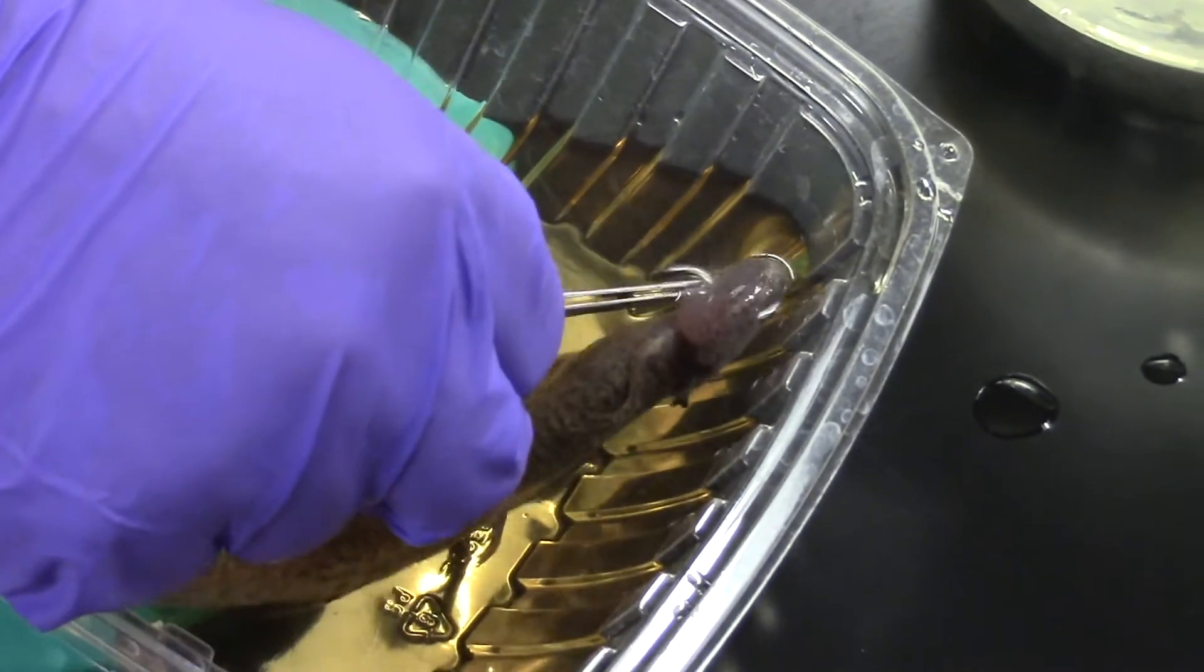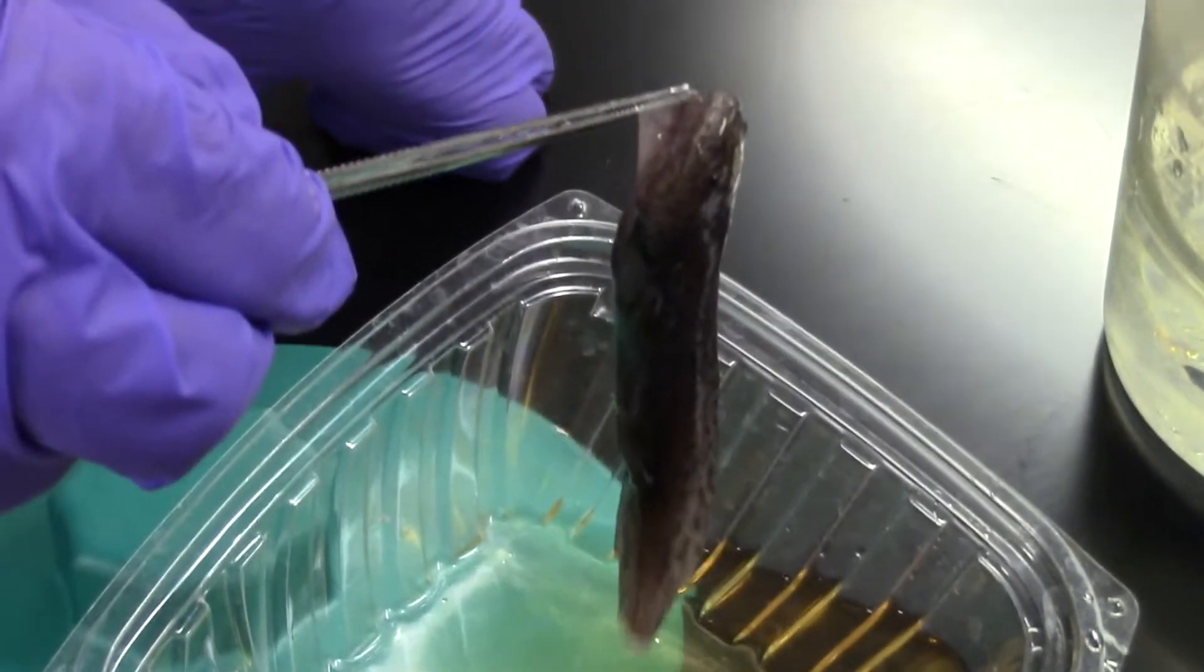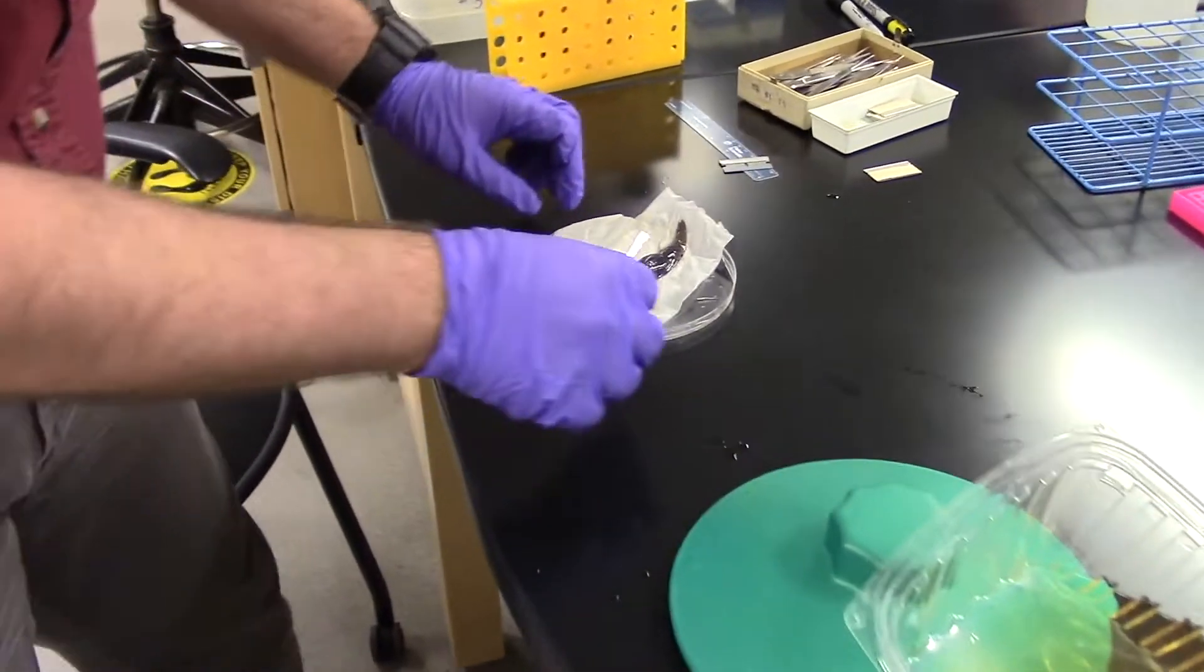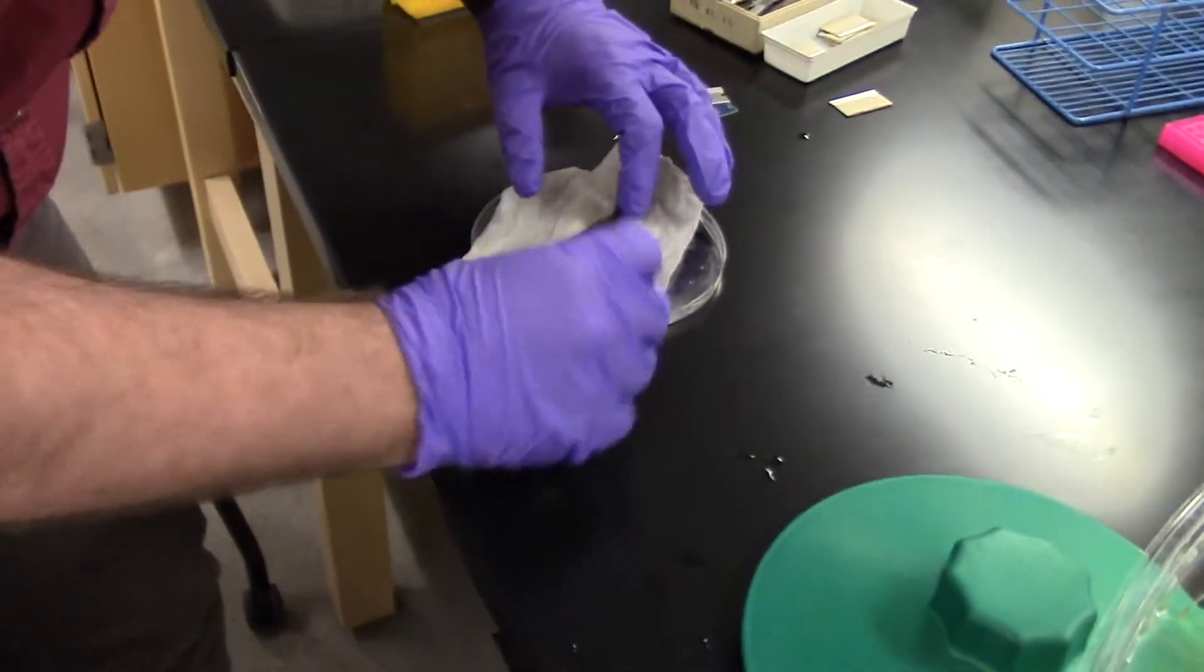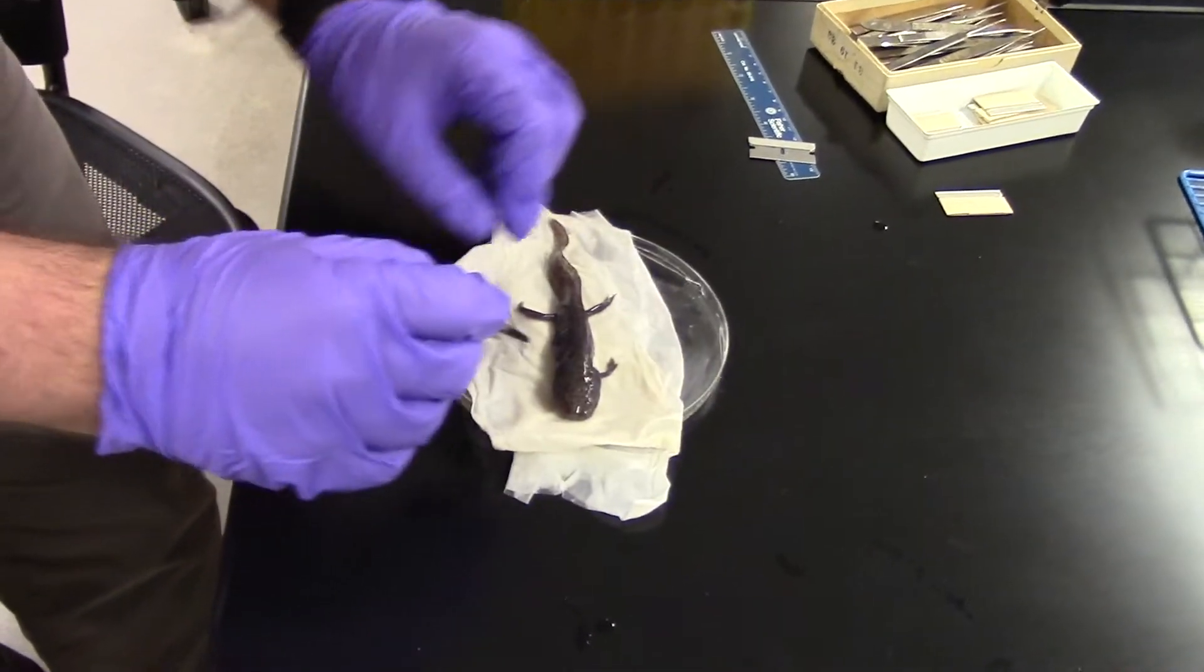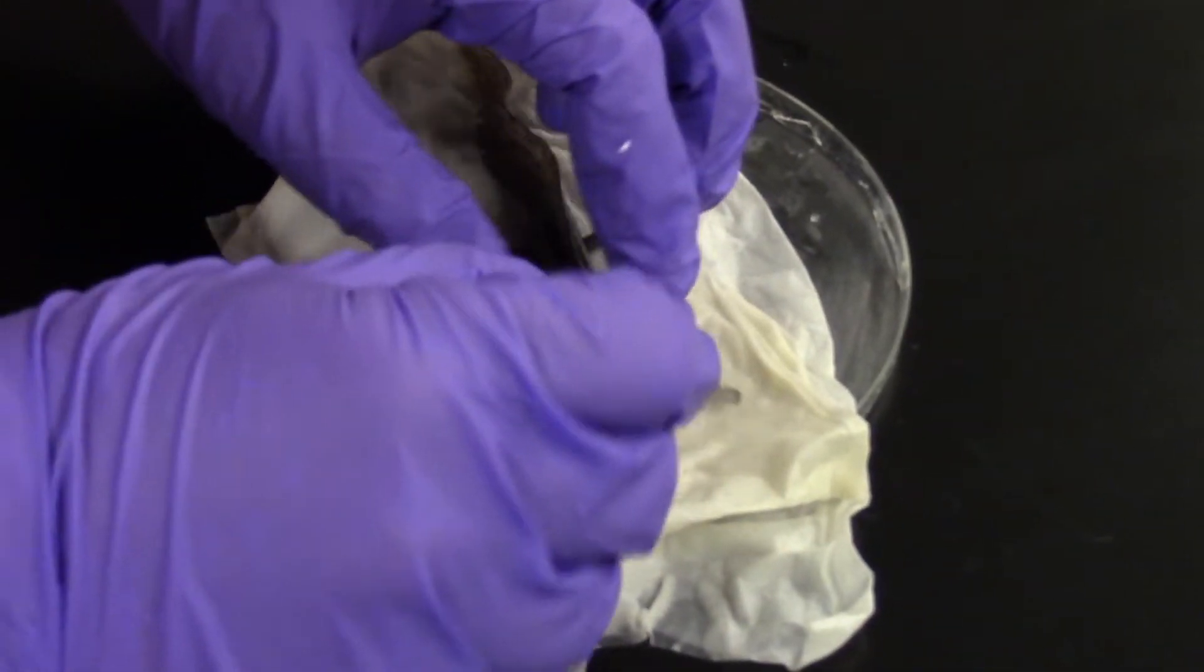I can pick up our axolotl by grabbing the flap of skin and I lay him on the dripping wet paper towel and I can isolate whichever portion I would like to amputate.